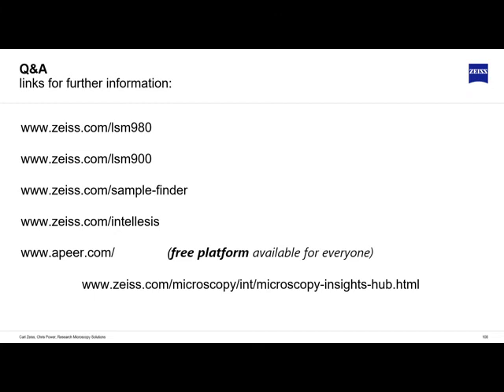So of course, it's only as good as the kind of questions you're asking. You could come to the wrong conclusions, but this is about large N, large amounts of data, sifting through things you couldn't do unless you had a ream of PhD students doing that for you, and also removing some of the bias. You know, how many of you have looked down a microscope and gone, "Well, that one looks good, and that one looks a bit dead," and yeah. Yes, okay, you might want to completely exclude nonsense from your results, but having it in an automated way, you can also make your data analysis fairer.